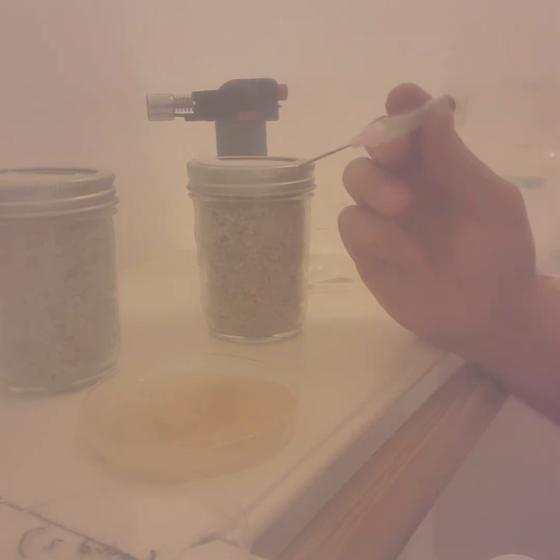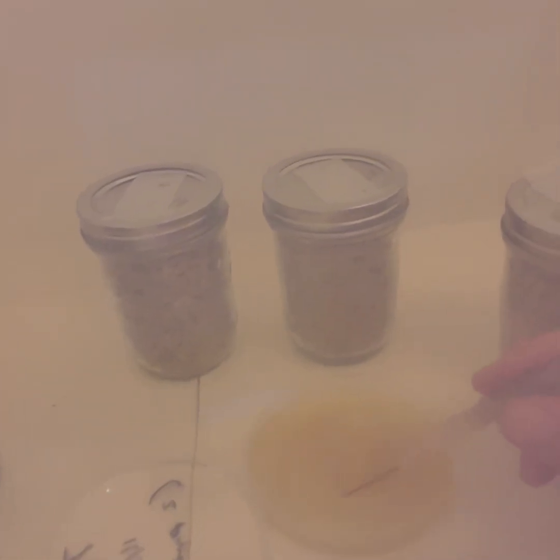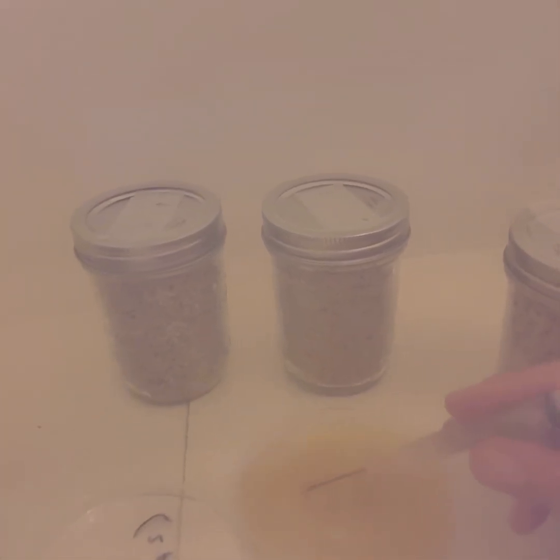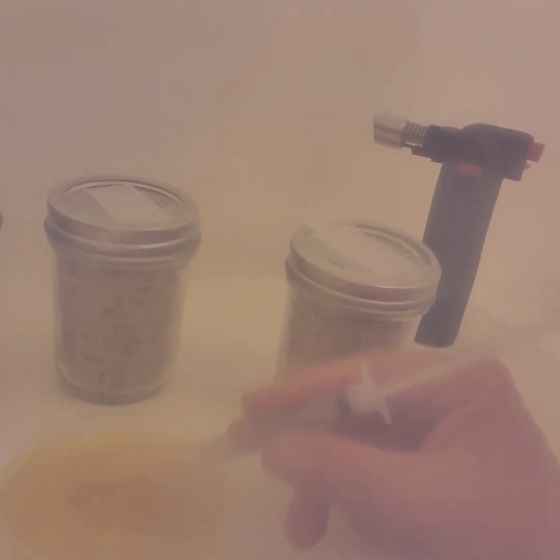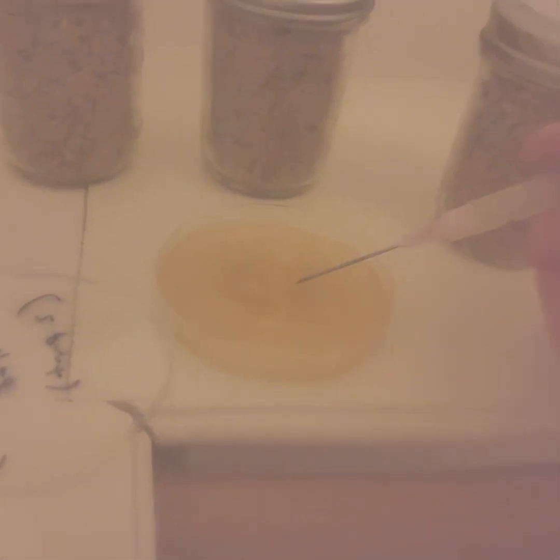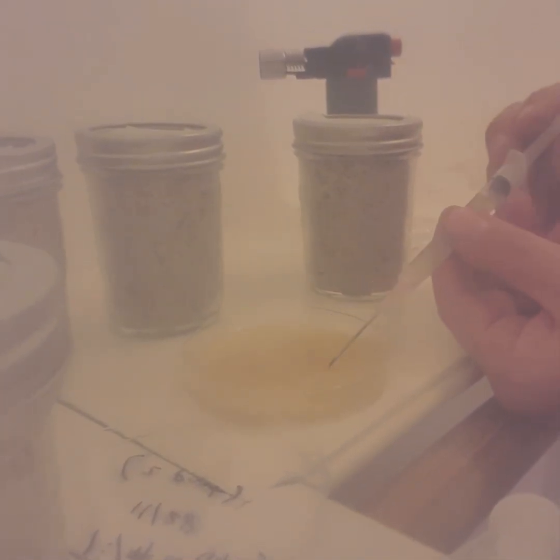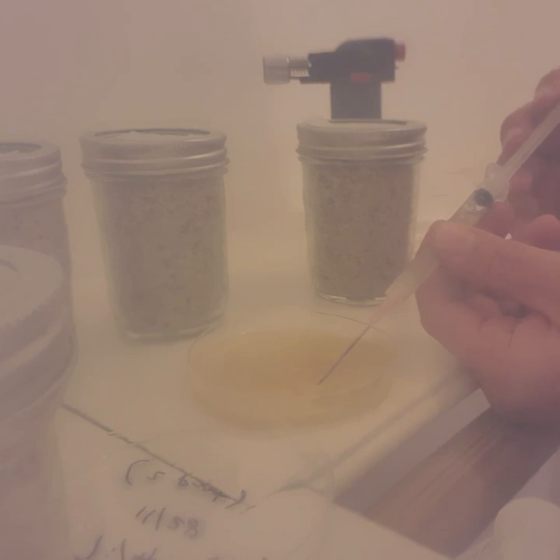I'm stirring up this dish — it had a pretty good mycelium culture, the one I showed earlier. I scratched the mycelium up, put some sterile water in from another syringe, stirred it up, and now I've been sucking it out. I've got this one syringe full already.